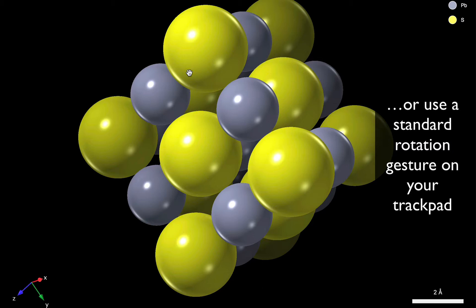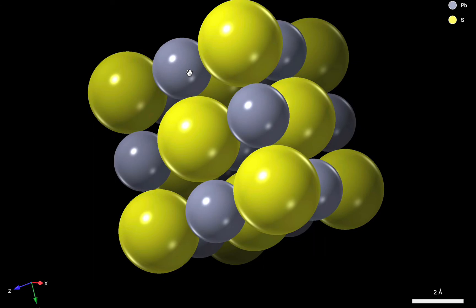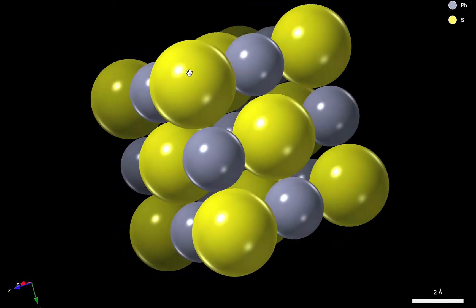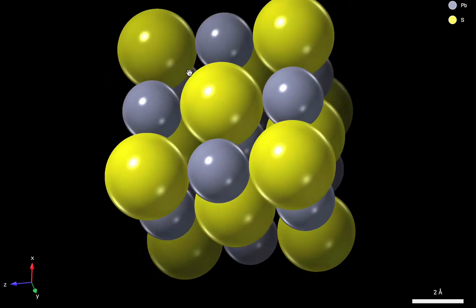Now this, again, is easier to do with a trackpad because we can use a standard rotation gesture on the trackpad, or we can slide two fingers across or up and down the trackpad to rotate about the other axis.